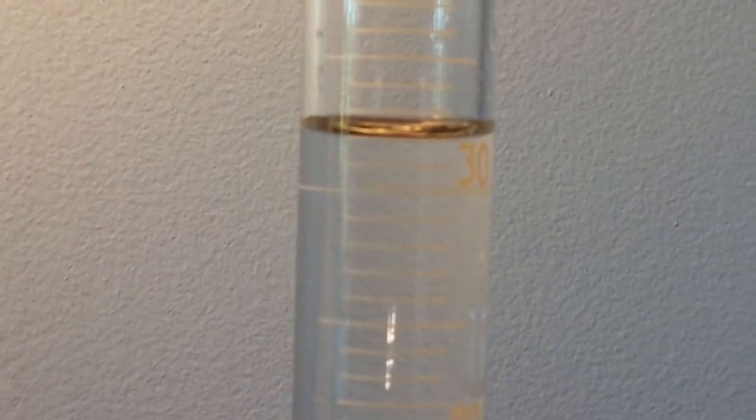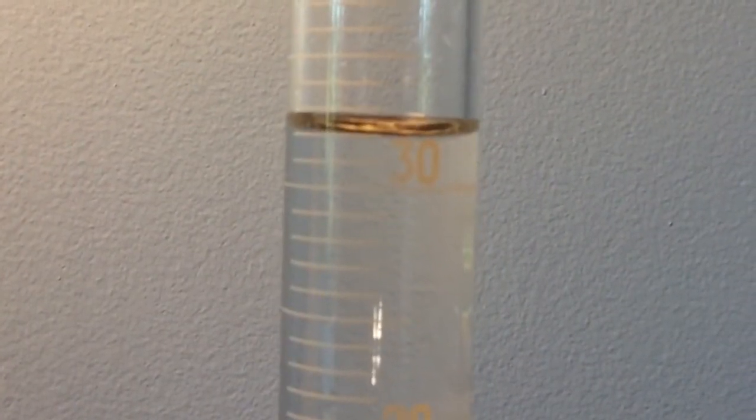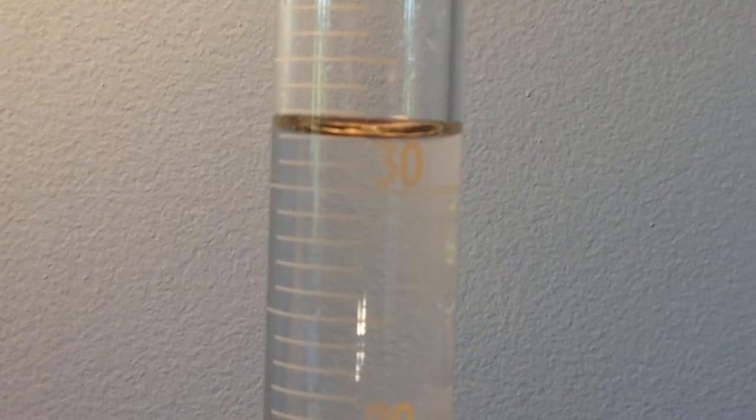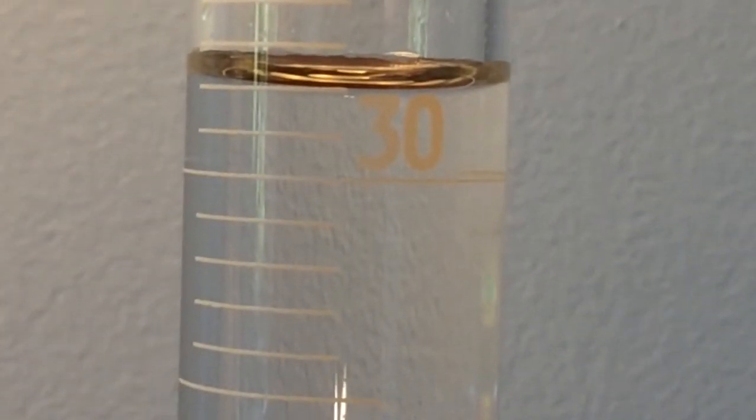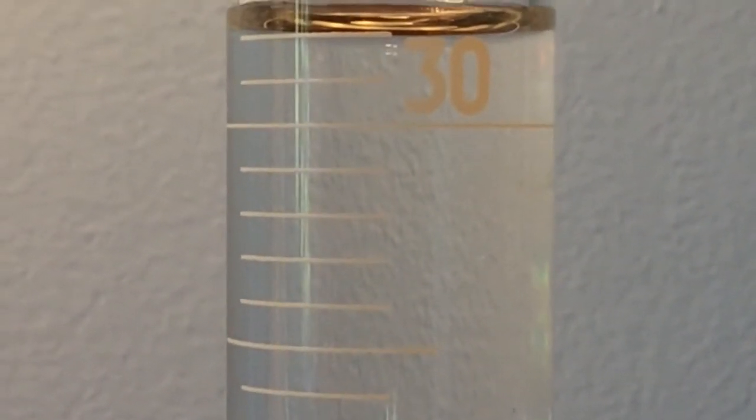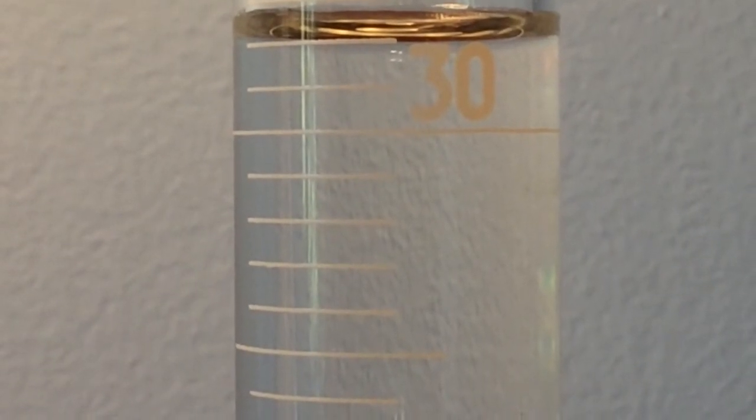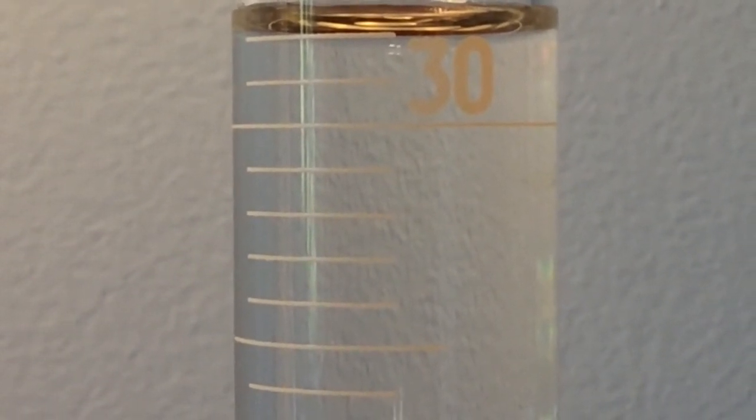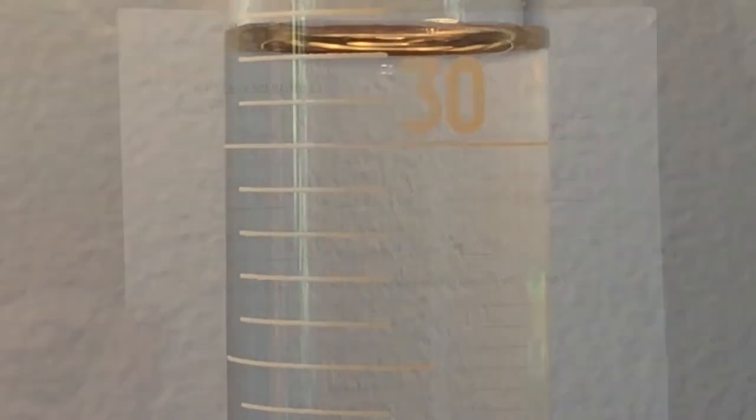Now we're going to take that metal cylinder and carefully drop it in here so it doesn't splash or break anything. We see that the liquid level went up. So again our job is to read this. Make sure there's no parallax. Let's actually look right at it. That might be right on the line.